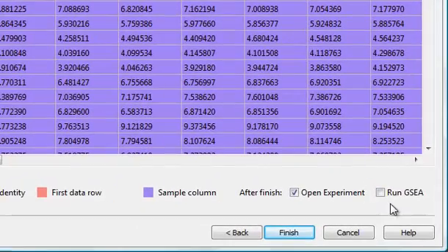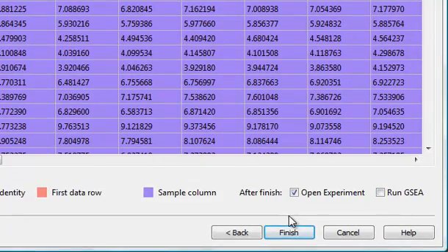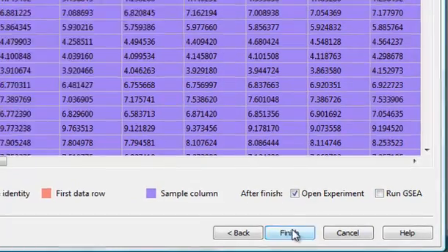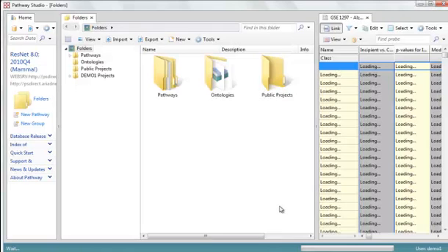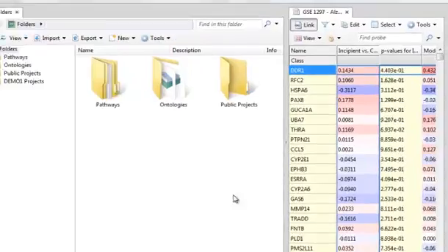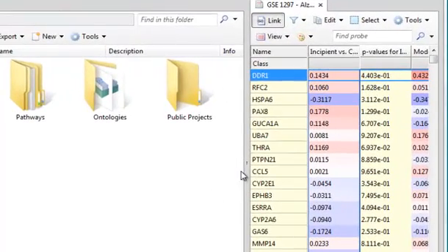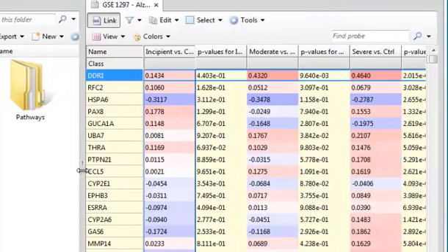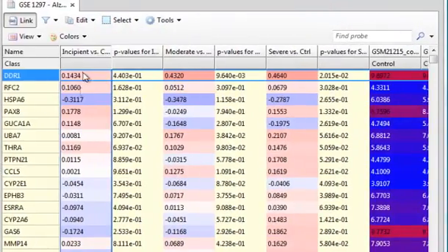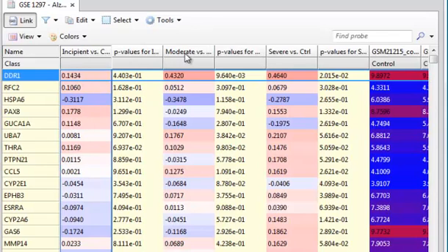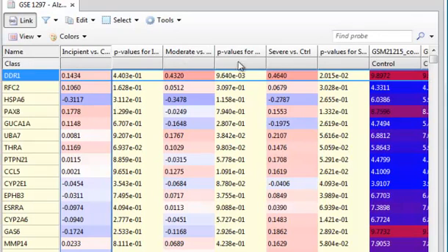I can also automatically run one of the analyses and I'm not going to do that. I'll go run them explicitly. So I'm ready to go. I'm going to say finish. Now it's completely saved at this point in the servers. So now I have my experiment data loaded. You can see I have my three experiments: incipient versus control, moderate versus control, and severe versus control.